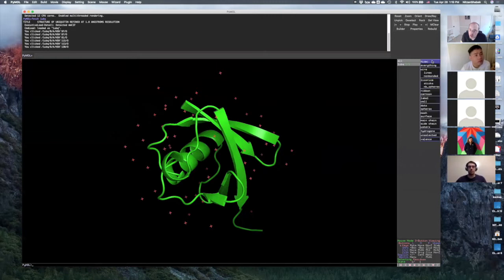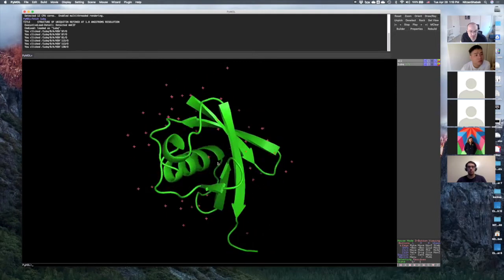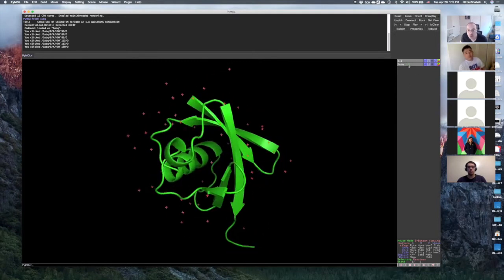The H means hide, what do you want to hide? And L means label. Do you want to label a certain element or amino acid? And C is just color because afterwards, this is all graphical representation. So we can color different things.